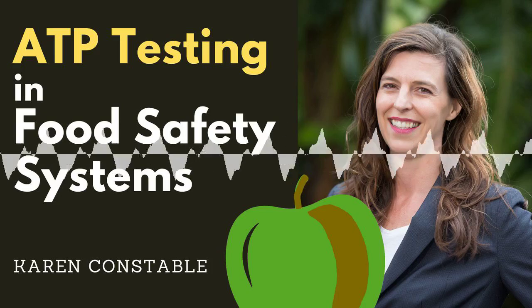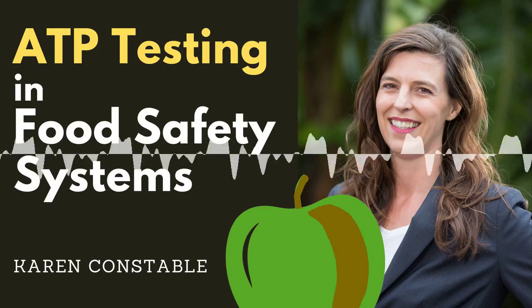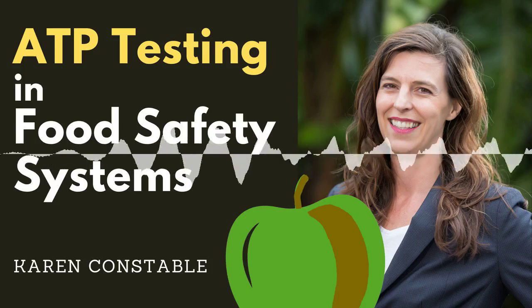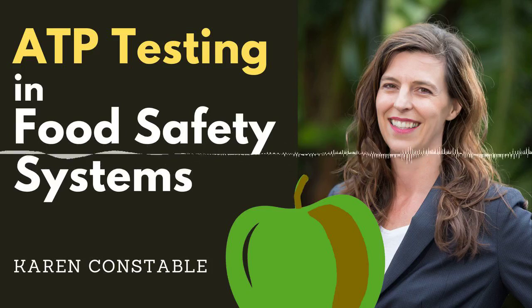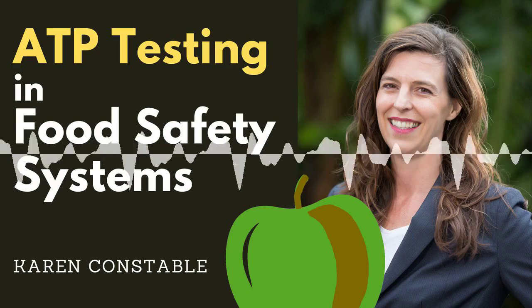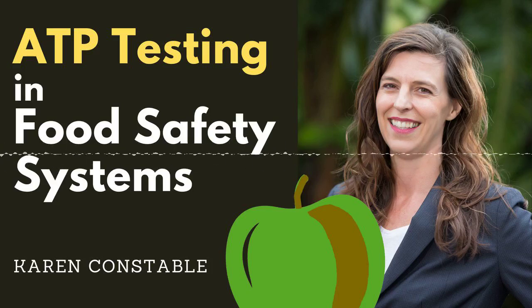So the basic process for ATP testing, and there's a little diagram in the email and the post, is you have a disposable swab to swab the surface that's being tested. Then you place the swab back into its little container that it comes in, a tube with activating enzyme reagents. That creates a reaction with the liquid bathing the swab, and then you insert the sample into a luminometer, and that reads the light that comes out from the chemical reaction. It converts it into a numerical test result.